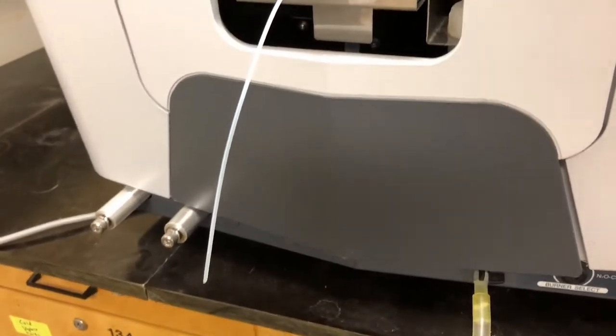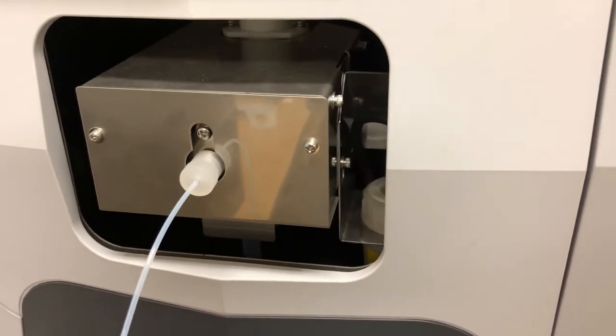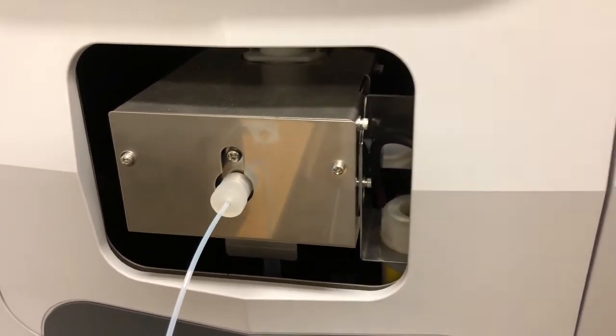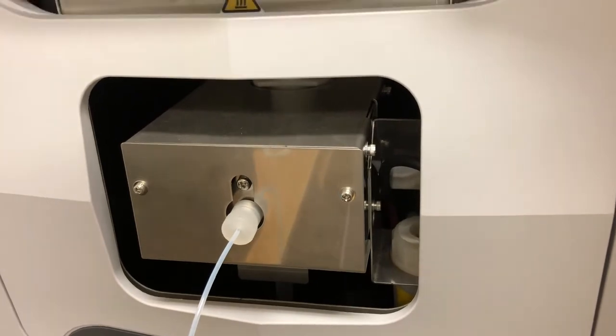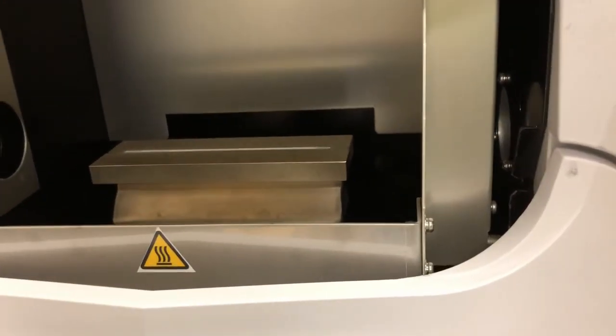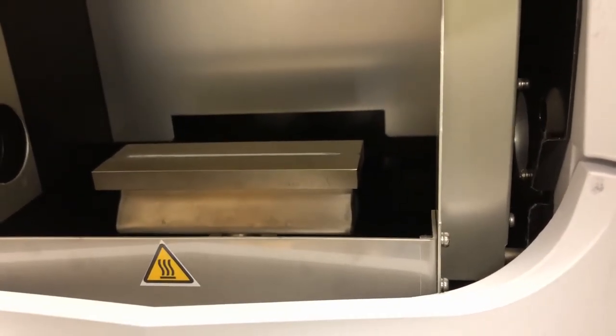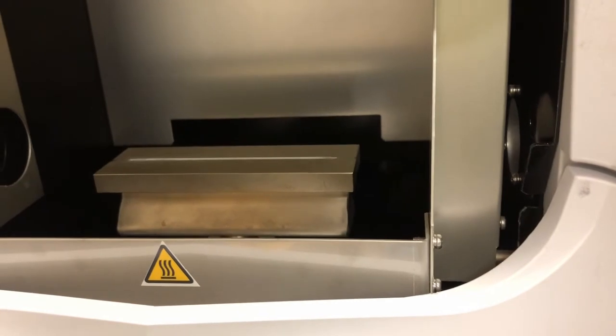So that's where the sample enters through the sample tube, goes through the nebulizer where it's vaporized, so our solvent would evaporate off, and then our sample or our standard with the elements that we're interested in would enter the flame. In the flame, the atoms are excited, and when they drop back to the ground state, they emit light.